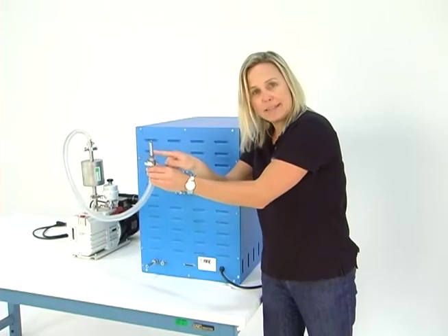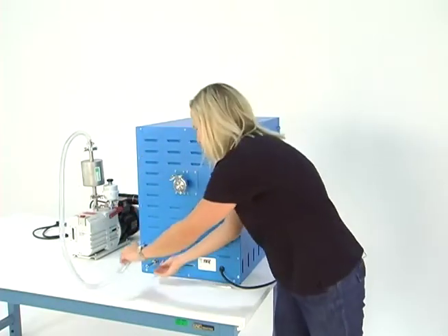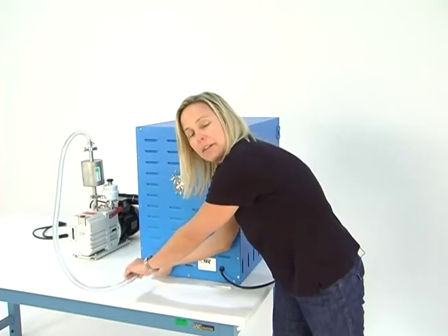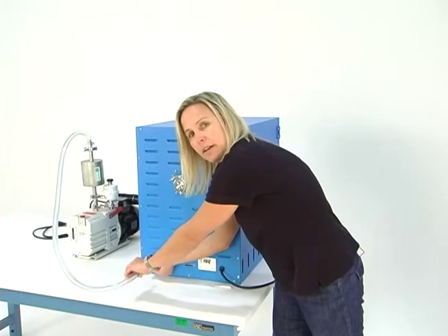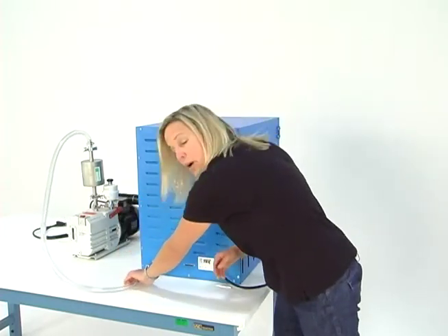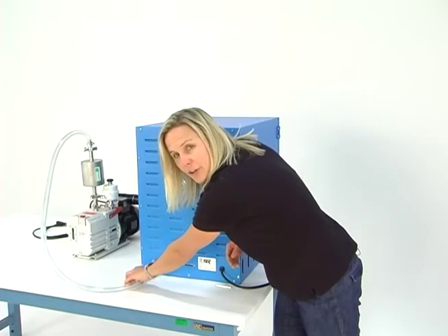Then you're going to take this end and simply insert it — like I already have — into this fitting on the back of the oven, the larger of the two fittings. And you have now connected your vacuum pump to the front vacuum valve on your oven.